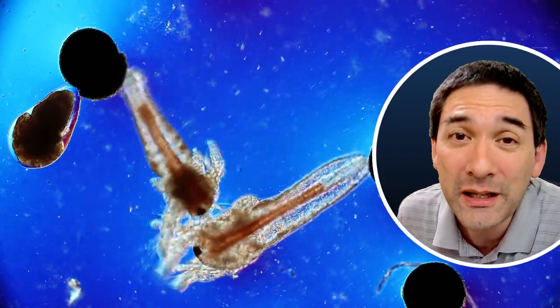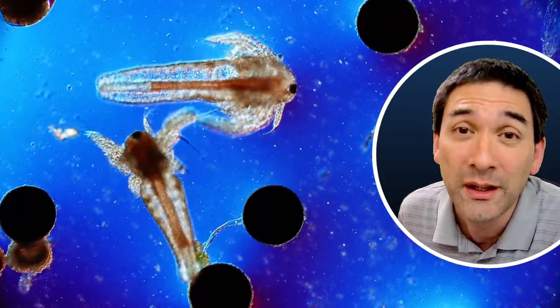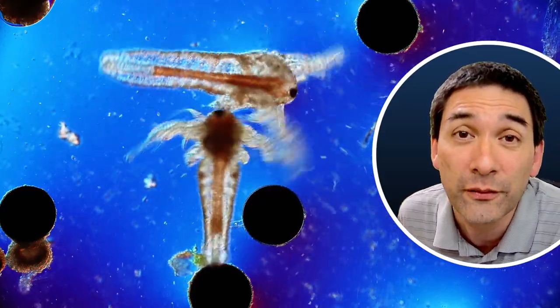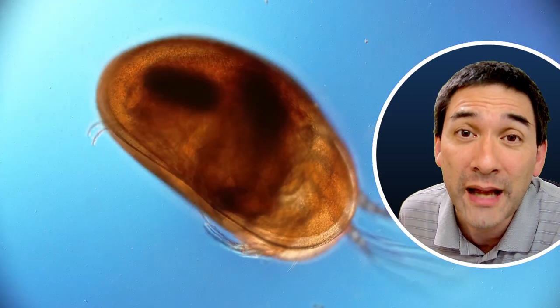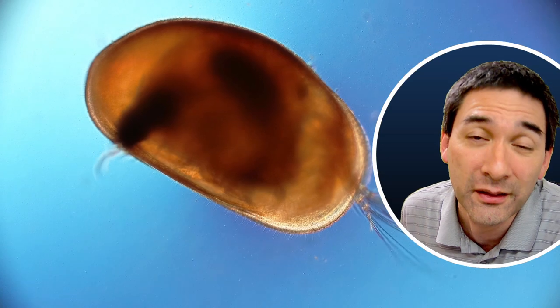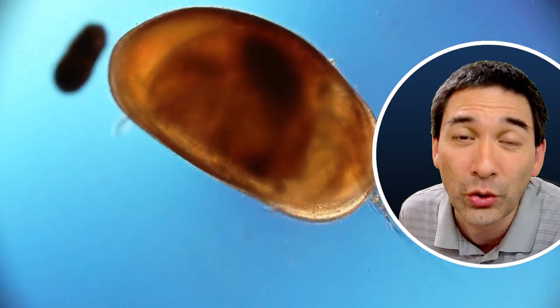I also made a whole range of YouTube shorts, short form videos, and one of them essentially was about so-called the sea monkeys as they're called commercially. These are so-called brine shrimp, and there are essentially marine saltwater shrimp, and you can hatch them out of those eggs, these round structures. These were the eggs. And another YouTube short was about so-called ostracods. It's an ostracod here.